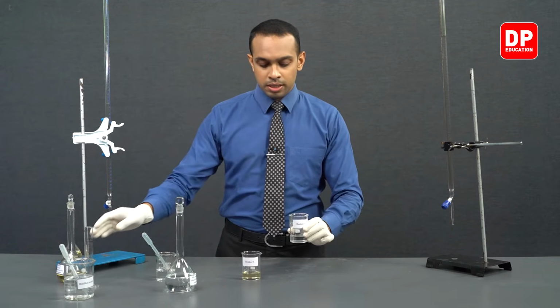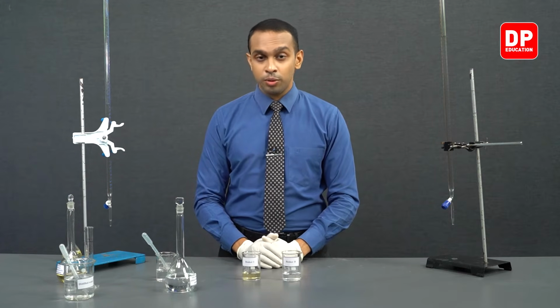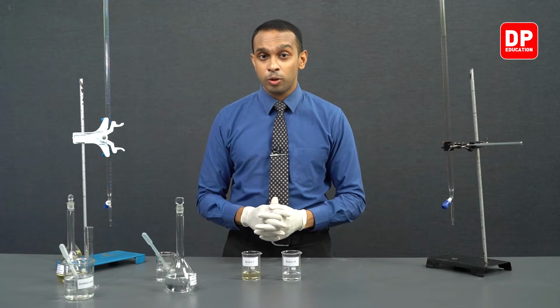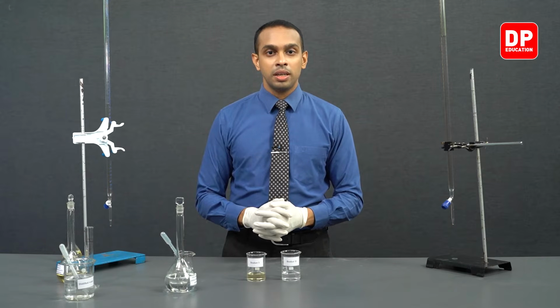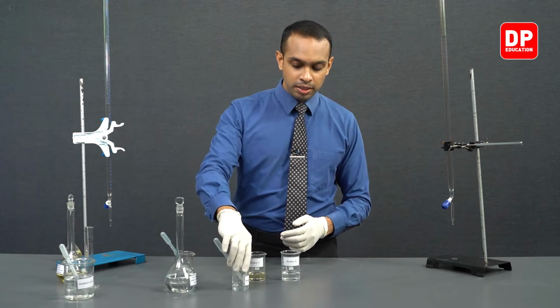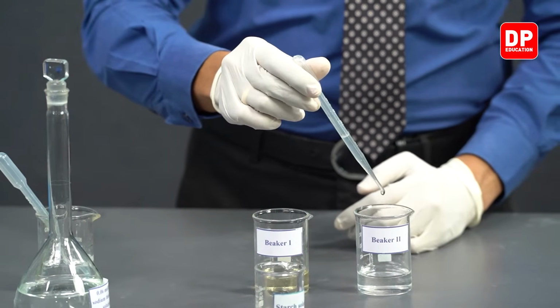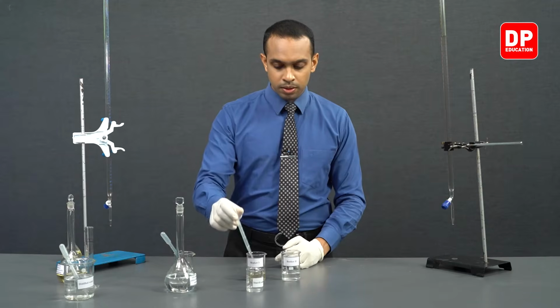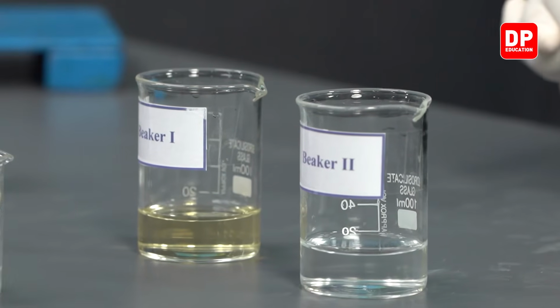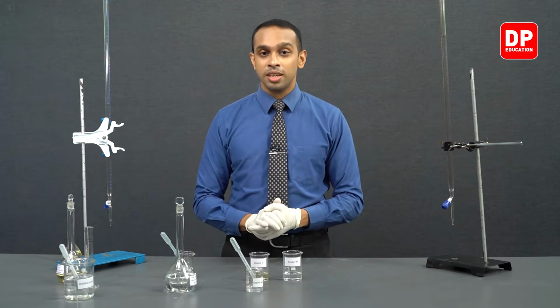Now the beaker 2 contains 15 cubic centimeters of our sodium thiosulfate solution and 10 cubic centimeters of potassium iodide solution. The concentration of potassium iodide solution we prepared was 3.0 moles per decimeter cube. Now we can move on to add starch solution as well. We have our starch solution here, and we can add roughly about 5 drops of starch solution into this beaker 2. So students, we have now taken the correct solutions into these 2 beakers.